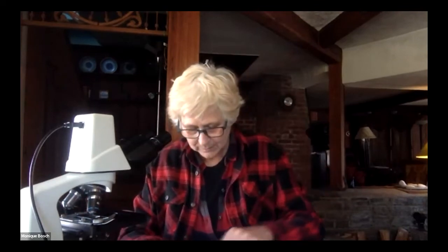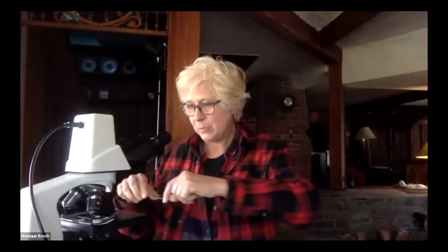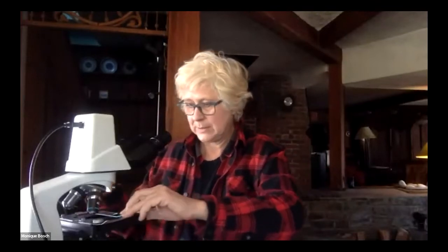Because the one will always be where you get the clean water. So then you take your slip cover, put it on top, and you want to see it spread out evenly across the entire slide. I don't know if you can see that. And then we're going to put it under the microscope. I'll take this one out that I was looking at earlier.